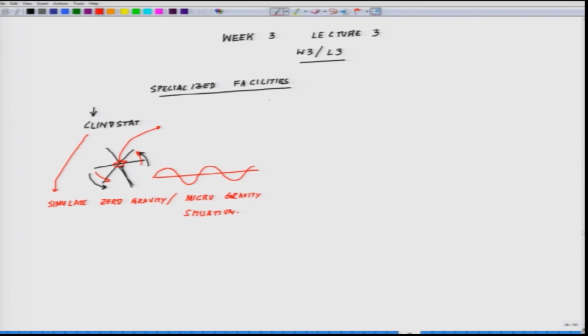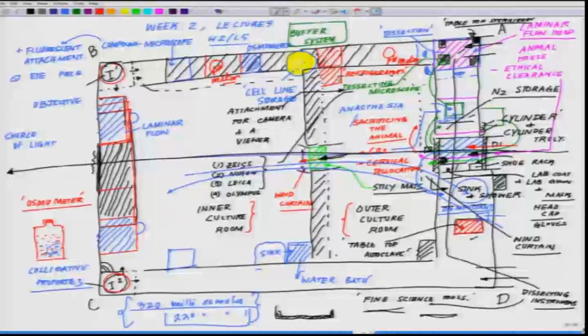Okay. So if you have to have a facility like that within your system, you have to go back and see where you can accommodate it. You have to have these spots left somewhere out here, for example. That is why I told you to leave space; you do not know where you may need things. Say you have a space biology setup out here. This is one specialized setup you are adding into it.